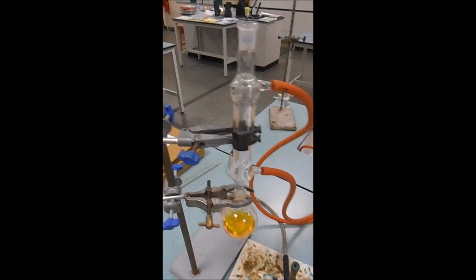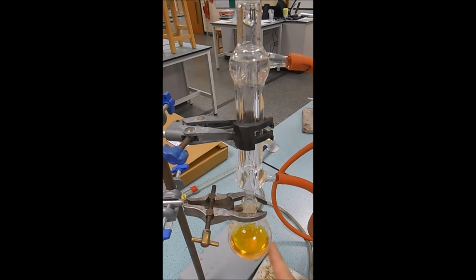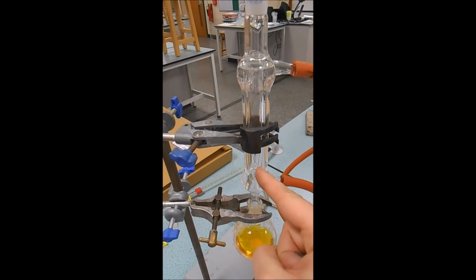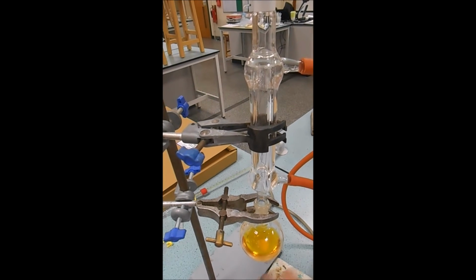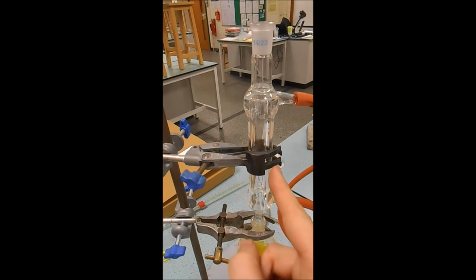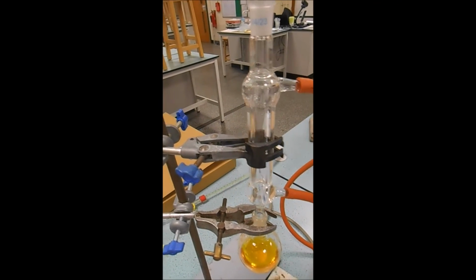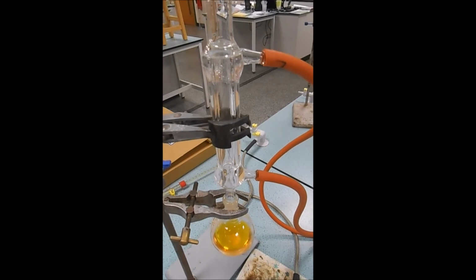There we go. So this time the propan-1-ol will heat up, it will evaporate first probably, it will get to here, you'll see it condense, and then it will fall down and drip down to the bottom. Any aldehyde which is made is going to go up, it's probably going to go a little further, but it will still condense on the side, and then it will drip back down into the reaction mixture. And this way we can make sure that as much propanoic acid as we can is made. None should come out at the top at all.